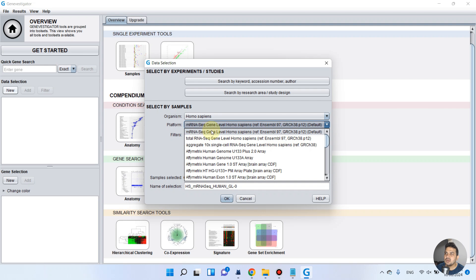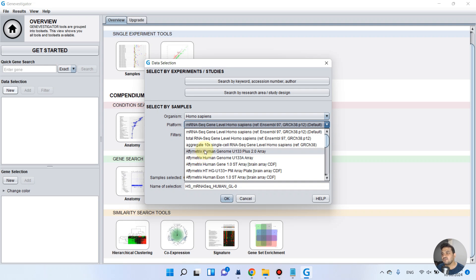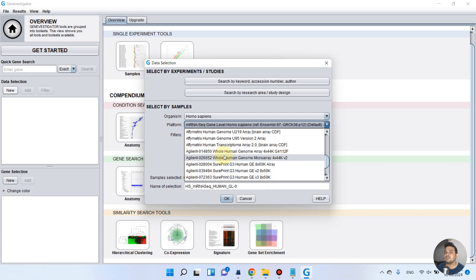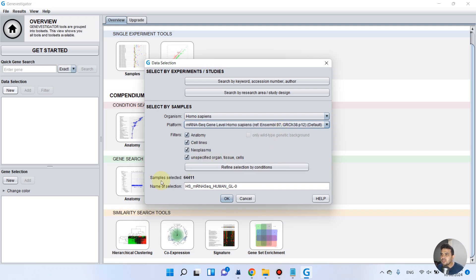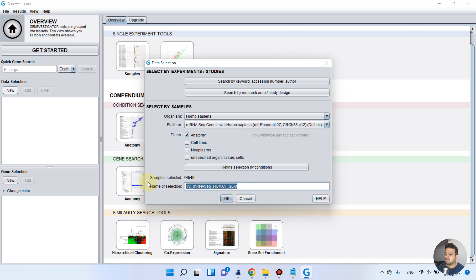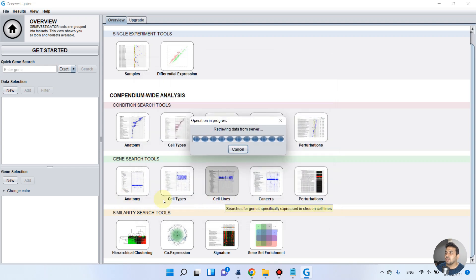As you can see, mRNA sequencing gene level Homo sapiens reference Ensembl 97 is used as default and it has a lot of genes. If you want to work with fewer genes, you can try the Affymetrix Human Genome matrix, which will generate less crowded results. We can also apply different filters like anatomy, cell lines, neoplasm, and unspecified organs. Since there are too many samples selected, for simplicity I will unselect some and name this selection 'video'.